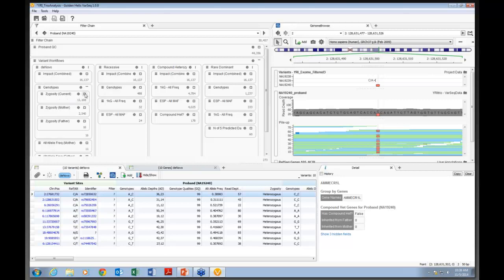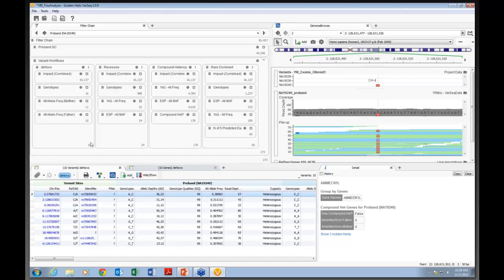So you can drill in and say, I'm looking for either heterozygous or homozygous variants in the child, or maybe you really just want the heterozygous, so you can turn off that option and specify then that the mother strictly needs to be called homozygous reference. The father similarly should be called homozygous reference. And ultimately, there are 16 such variants that after going through a few more levels of quality control, we find just 10 that fit our criteria for a de novo mutation.